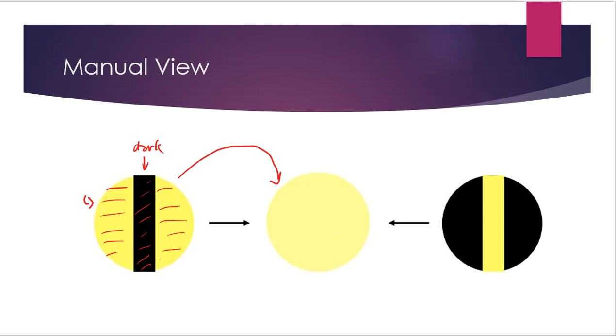That's what a lot of people were confused about, because they might have gotten to a point where all light was coming through, but the intensity of the light was not the same. So you could still see a division line, and you don't want to see a division line in these polarimeters when you begin to use them. So we're looking for something universal. We're looking for something you could call homogeneous from top to bottom. It looks the same from left to right, from top to bottom.